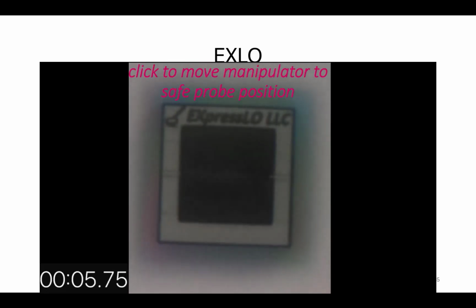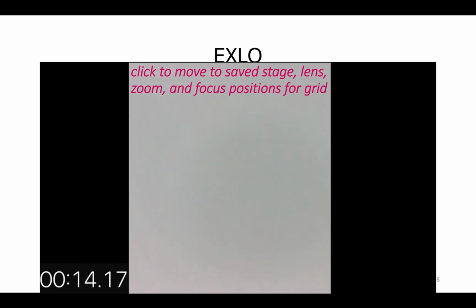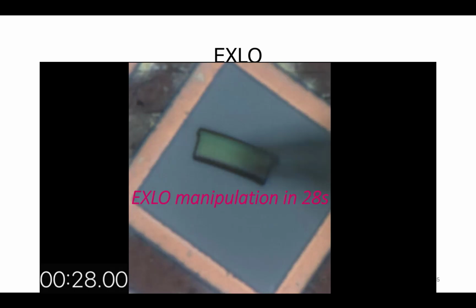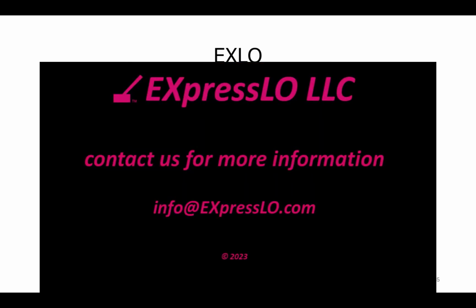Okay, pick up the sample. Move to your saved stage position on the grid. And then you just bring it down. And set it right on top of the grid. So she did that in 28 seconds. Pretty impressive.